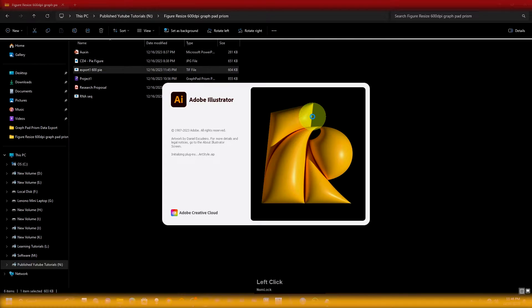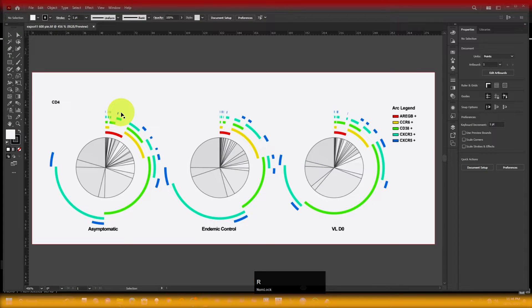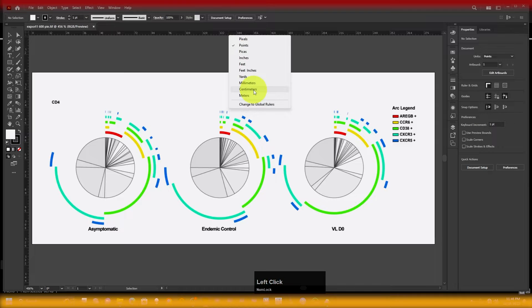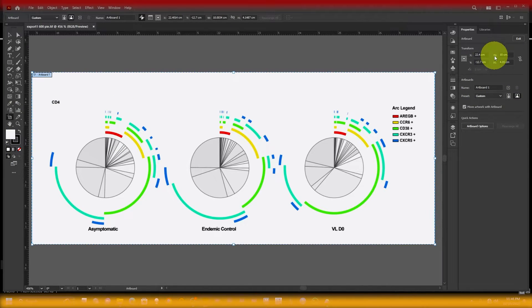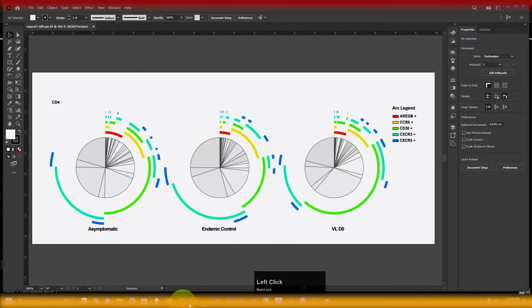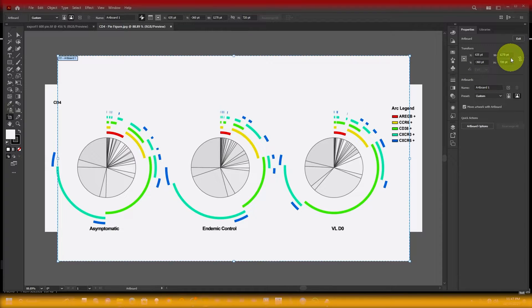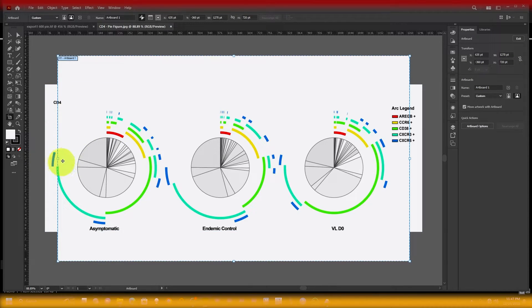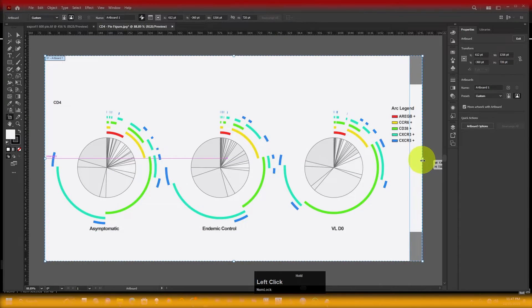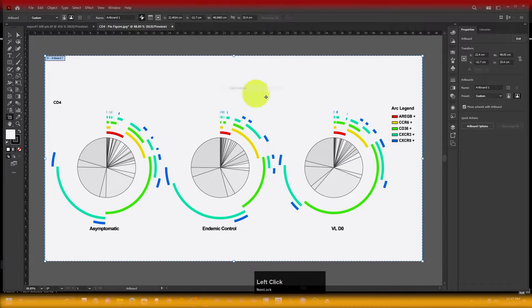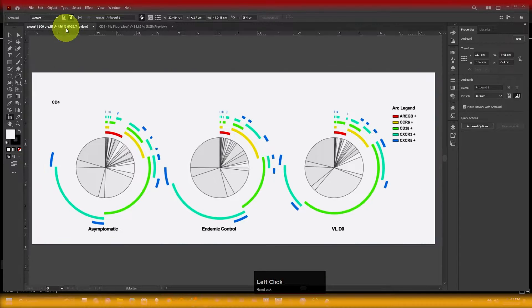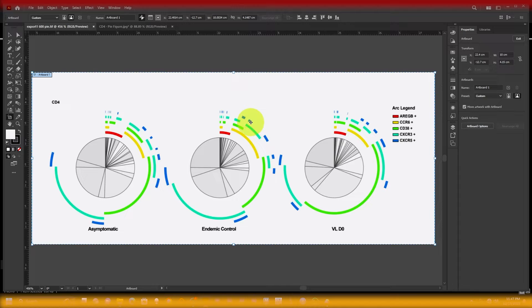If you open this image in Illustrator and use Ctrl+0 and Ctrl+R to check the scale, you can see the width and size of the image. To compare, opening the original image in Illustrator and checking the size in centimeters — initially the size was 48 centimeters — and after export with the change in GraphPad, the exported file is now 10 centimeters. So you can see how precisely you can change your figure's size in GraphPad.